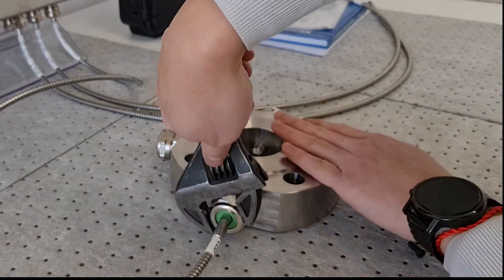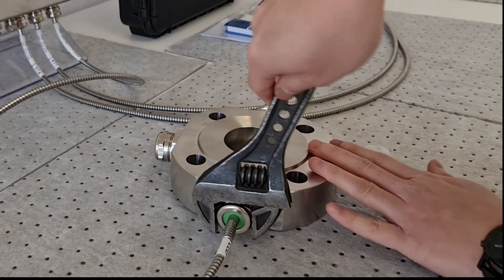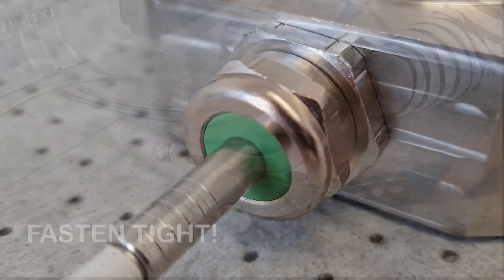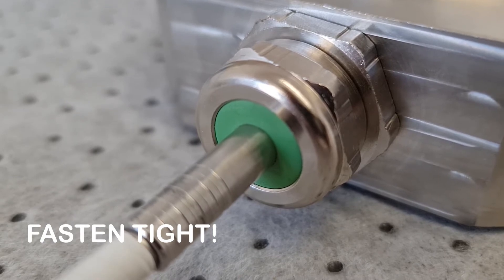The cable glands on the measurement cell should be firmly and tightly fastened using a spanner. When tightened, there should be no gap visible between the cable gland sealing element and the fiber optic cable.